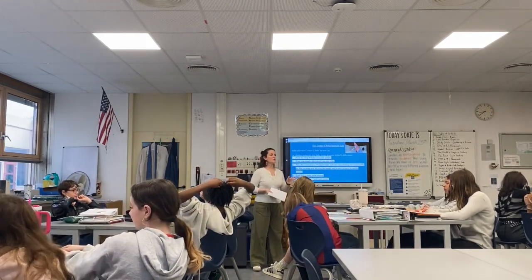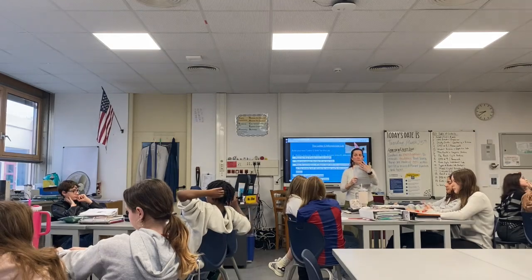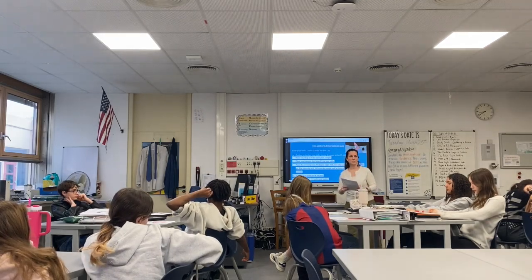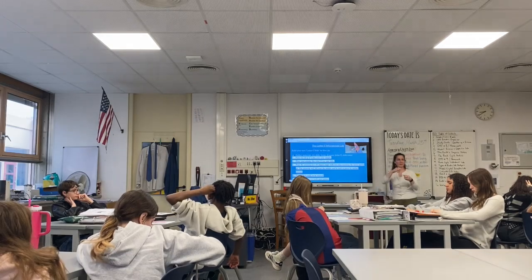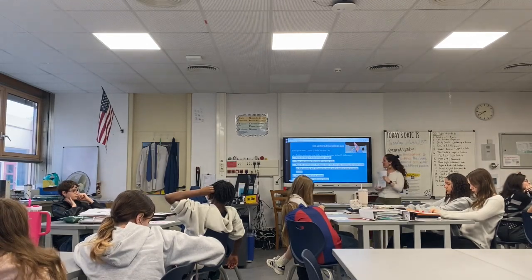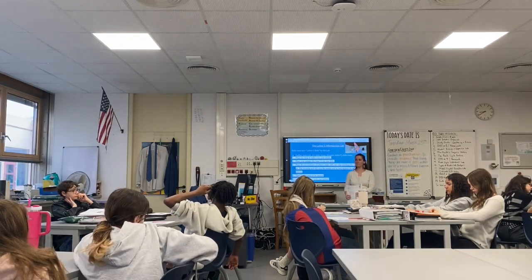So what we're going to do is you and your partner are going to find a microscope, and go up there and read through your lab really quickly so you understand what we're going to be doing today. And then I will direct you to creating your slide. Mr. Eller or I will come by with some water to help you create your slide. So once you get up there and read through your lab, you're going to complete numbers 1 and 3 with your partner while you wait for your slide to be created. Okay?